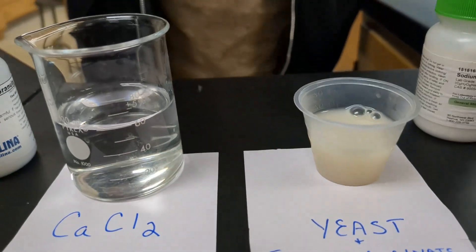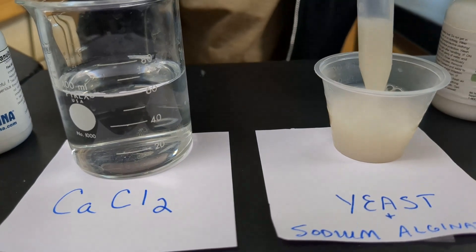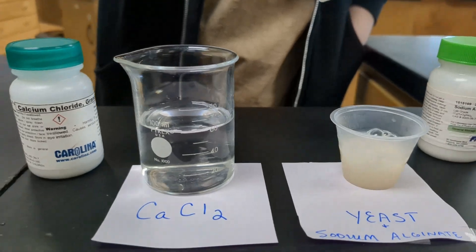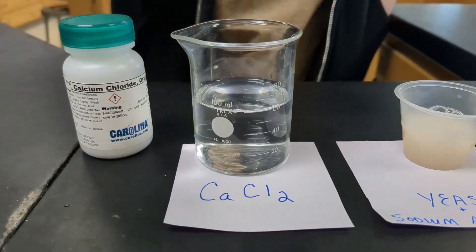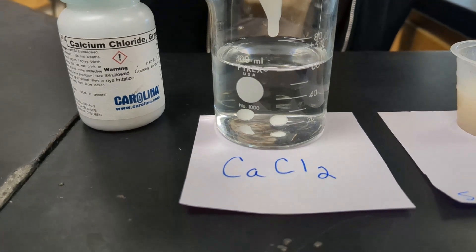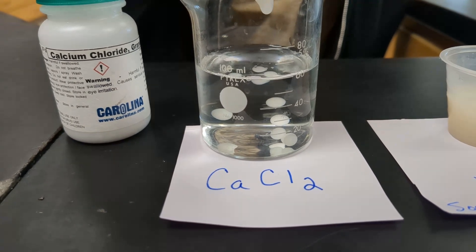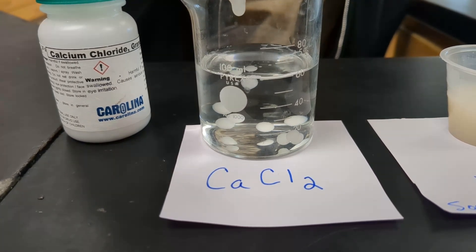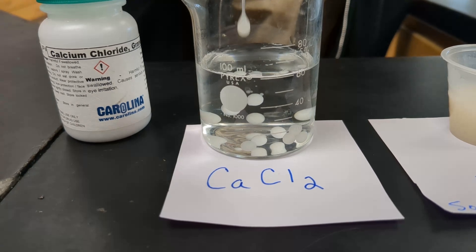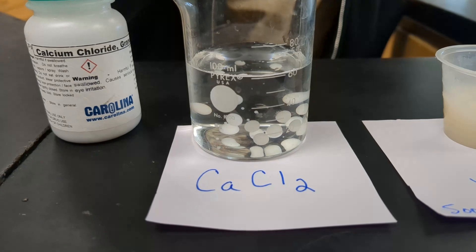What you're going to do is you're going to take the pipette, draw that up, and then you're going to take that over to the calcium chloride and drop it in and get a little closer to the water. And then these little spheres are going to form. You want to try to get them uniform. They should all be about the same size. Nicely done.